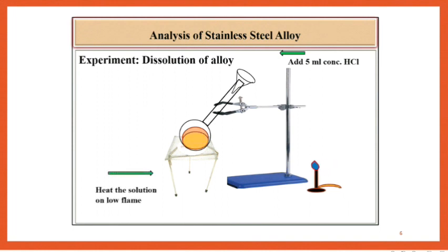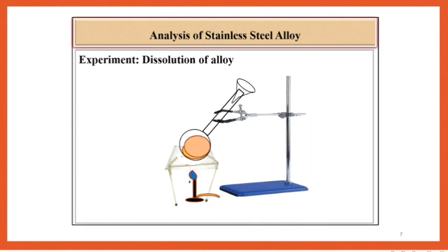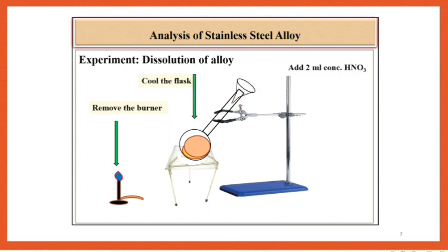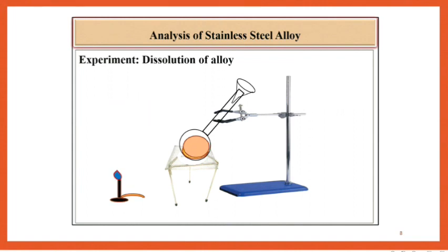Heat the solution on low flame. If the alloy does not dissolve, remove the burner and cool the flask. Thereafter add 2 ml concentrated HNO3 and heat the solution again until the alloy gets dissolved.